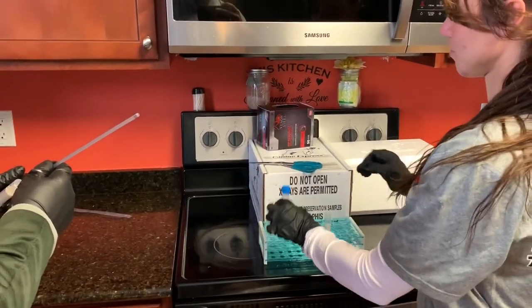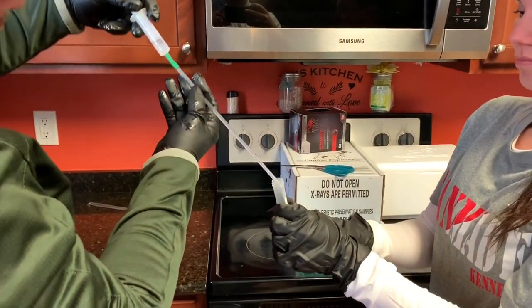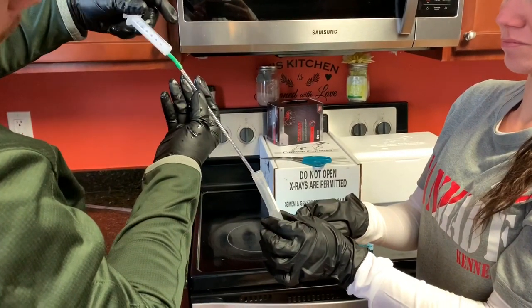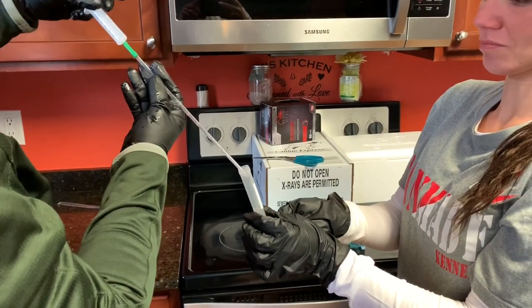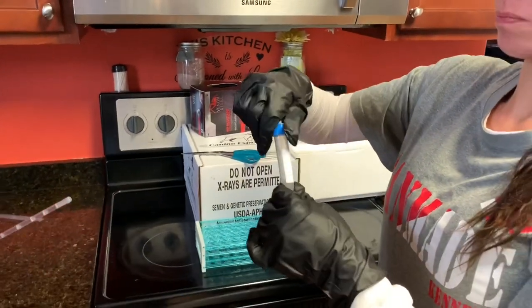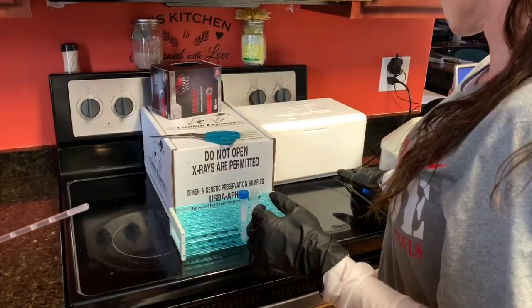Okay, open up this one, and then put the rest. It's very simple. All right, she's gonna cap them both off, and then we'll put them in the centrifuge.